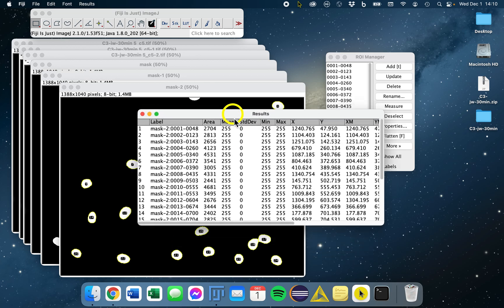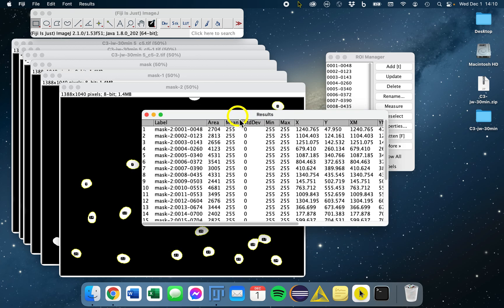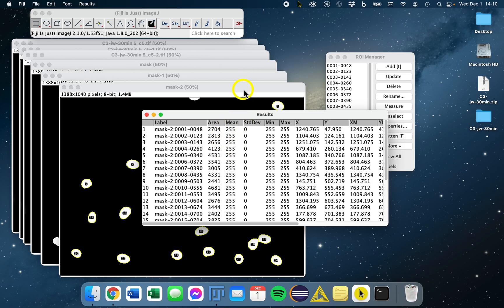Do you notice anything strange about our mean measurements here? We actually ended up measuring our mean values from the binary mask. What we need to measure is the original image.